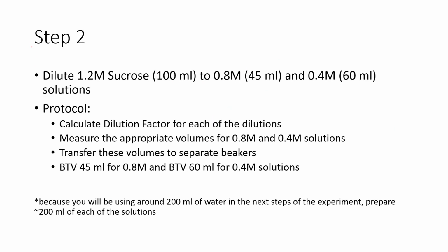During the next step video you will have to get familiar with dilutions, and in this case instead of preparing 0.8 and 0.4 mole per liter concentrated solutions, we are going to dilute 1.2 molar sucrose to these concentrations. So in this case you will know both how to prepare the real solution and how to use one as a stock. So going from stock to working solution.